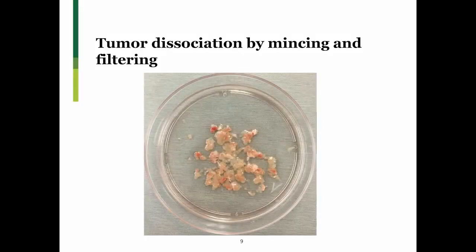Basically, you put the tumor into these dissociation tubes. We add an enzyme mix, and the tissues then get disaggregated in a programmable and reliable way.